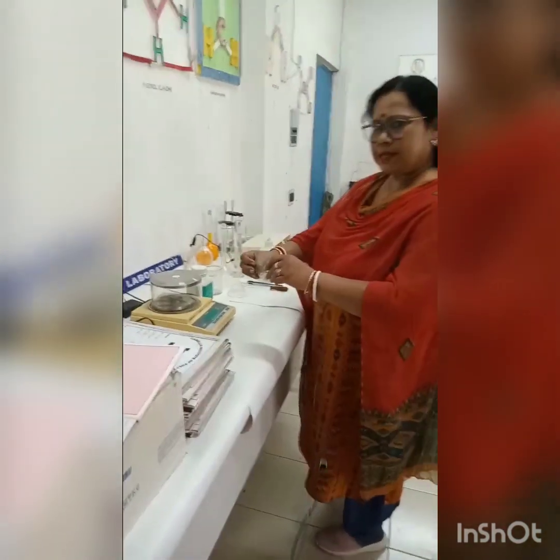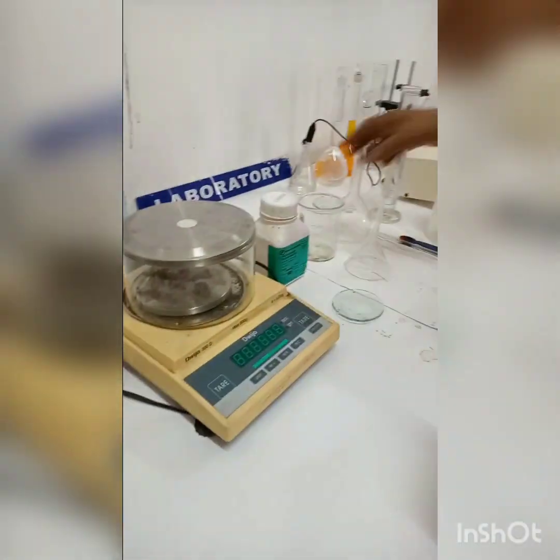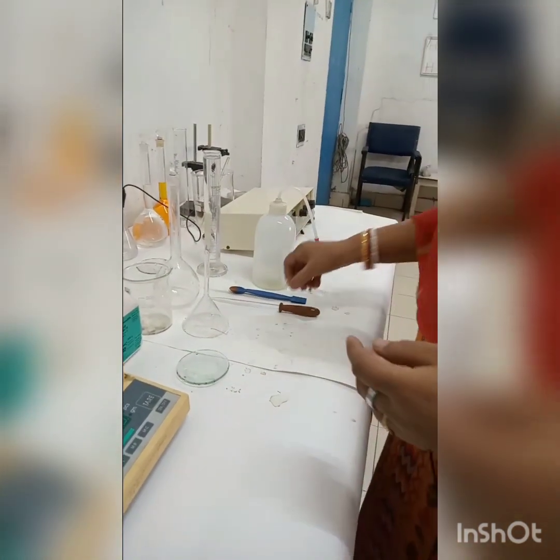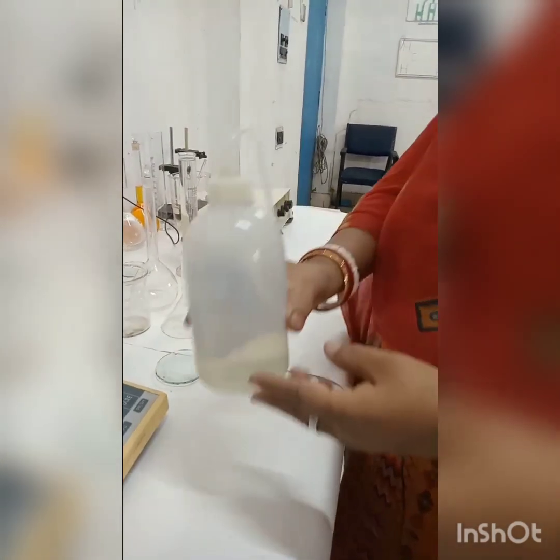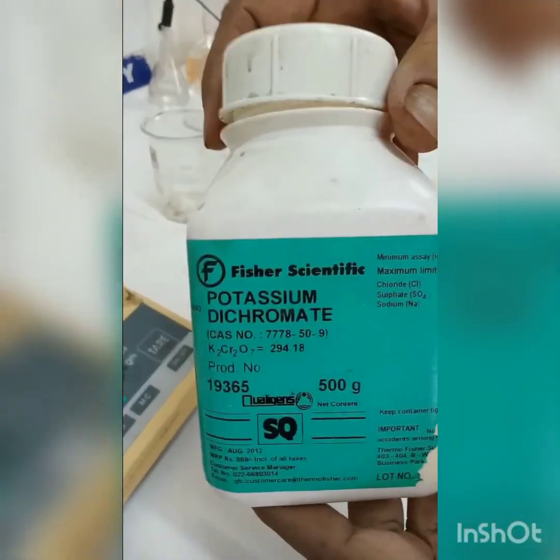Watch glass, weighing machine, 250 ml beaker, 250 ml volumetric flask, glass rod, spatula, dropper, distilled water, and potassium dichromate crystals.